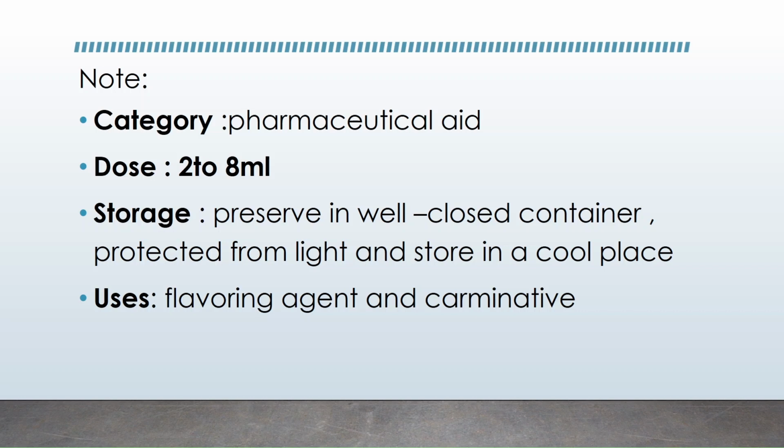Storage: preserve in a well-closed container, protected from light, and store in a cool place. So when you're writing your label, make sure you include this on your label. It is used as a flavoring agent and also a carminative. Okay, you can silence the N. Carminative. Yeah.